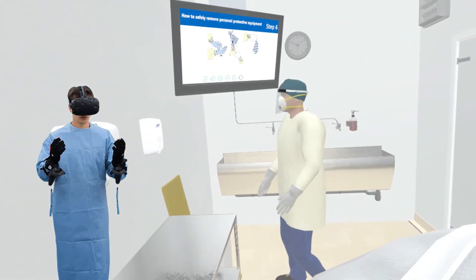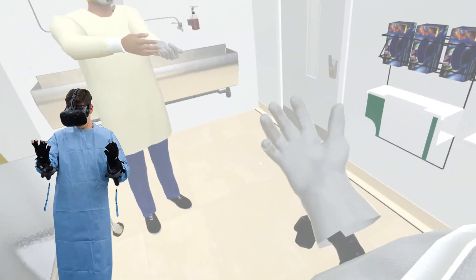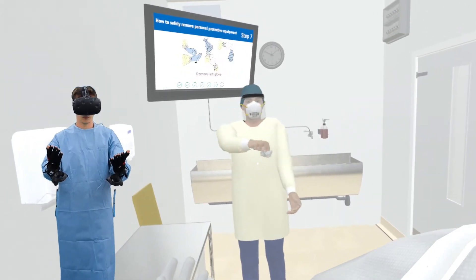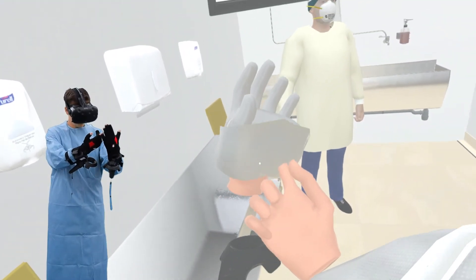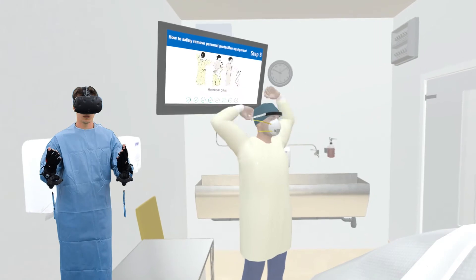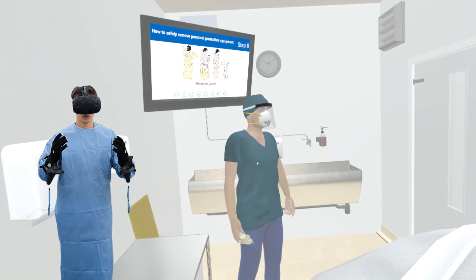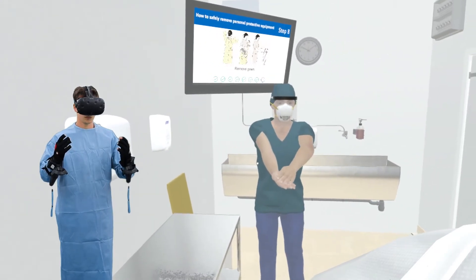Step into the anteroom and ensure the door is closed behind you. Remove gloves using the glove-to-glove and skin-to-skin technique. Place in the garbage. You may perform hand hygiene at this time if there is any concern your hands became contaminated during glove removal. Next, untie the gown around your waist and at the neck. Grab the straps from the back of the neck and slowly pull the gown forward and peel it away from you, touching only the inside of the gown. Be careful not to let the gown touch your clothes. Roll the gown into a ball. Dispose of the gown in the garbage. Perform hand hygiene.